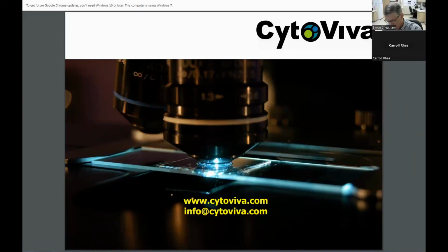So depending on how you functionalize the nanoparticles, their size and other characteristics, they can be taken up by the cell and they can co-localize in some very interesting places in the cell. And it never ceases to amaze me what these researchers can do with that.